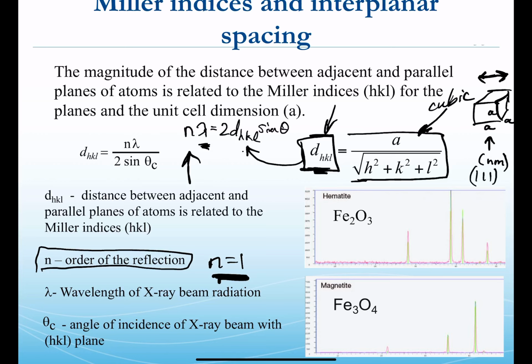Okay, so you can see hopefully that the technique is very useful for helping us distinguish between very similar atoms and packed structures of those atoms, and even ionic type compounds. Here's oxide of iron. So we have the hematite form, and we have the magnetite form, and their formulae are different, and clearly their XRD patterns, the pattern at which we find diffracted X-rays, is very different. So this is a bit of a fingerprint for material if you're tasked with trying to identify a crystalline sample.